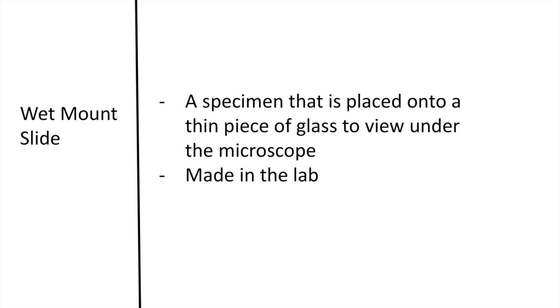For example, maybe we want to view how our hair looks underneath the slide. So we would need to use our hair. We wouldn't buy that from a company. We would need to take our hair, put it onto a slide so that we can view it under the microscope. This is when you would want to make your own slide.